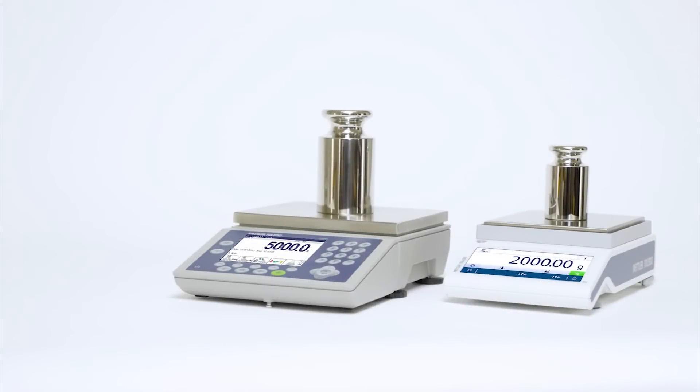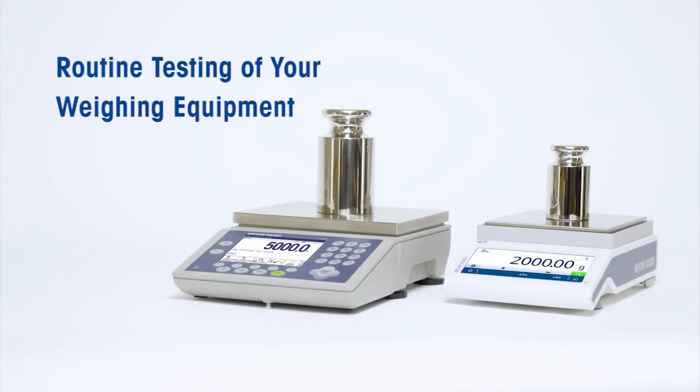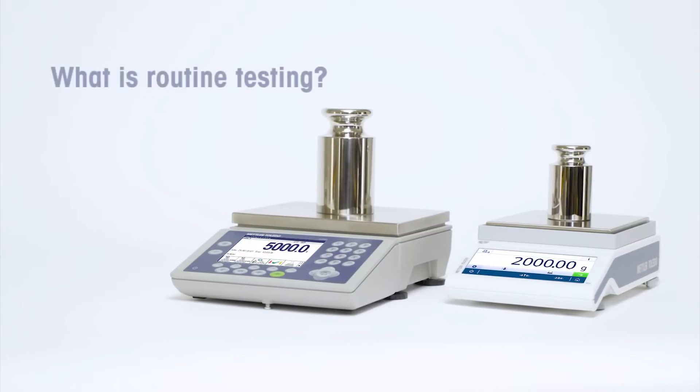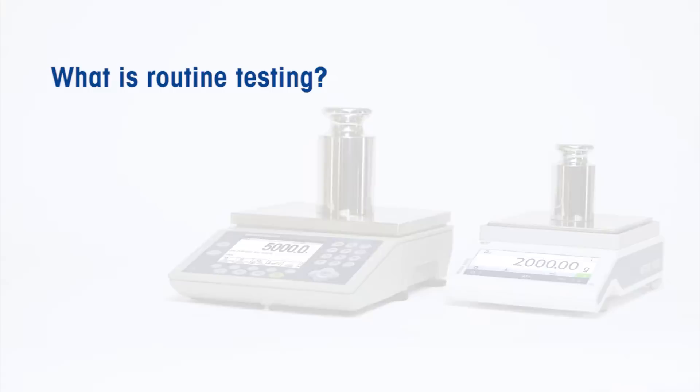Are you sure your balance or scale is performing as it should? Could you document its performance if you had to? In this video, we will talk about the routine testing of your balance or scale. You'll learn what routine testing is, why it's necessary, and how to do it right.